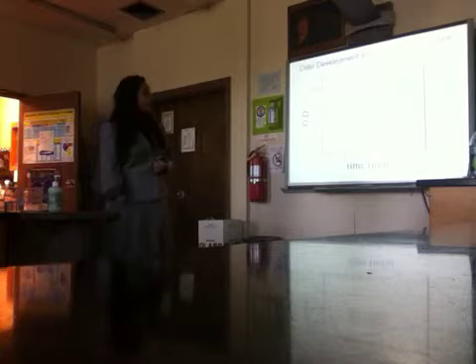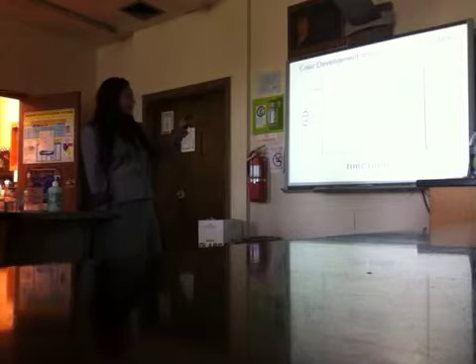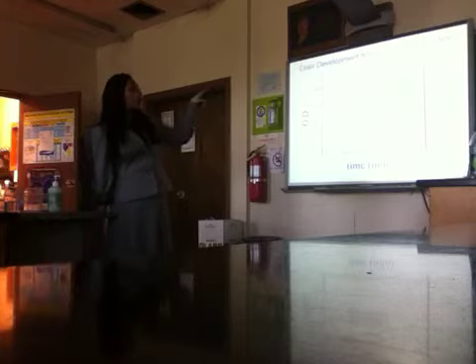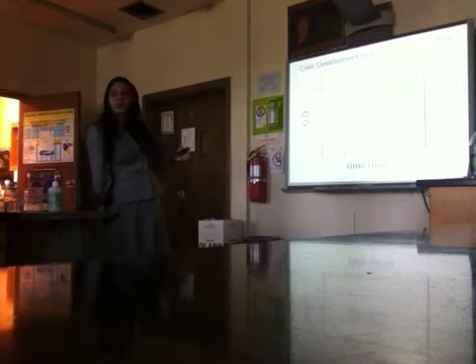To begin the experiment, we need to know how long we have to wait for the color development. For that, we did this assay on the diode array using sodium nitrite and Griess reagent. We can see from the figure that after 20 minutes, the color reaches the plateau level. So in each and every reaction, I will wait for 20 minutes.